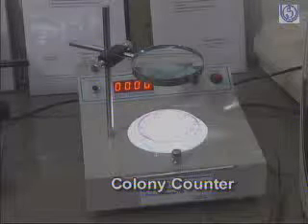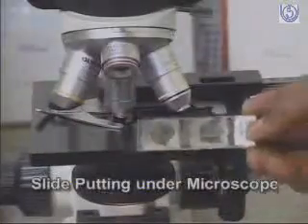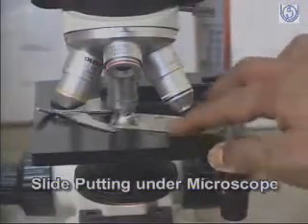Now you see, this is the colony counter. Under this colony counter we put the plate where the pathogens are, and we can count the pathogens. We can identify the species by putting the standard slide under this microscope after proper magnification. And now we can move to the next section.